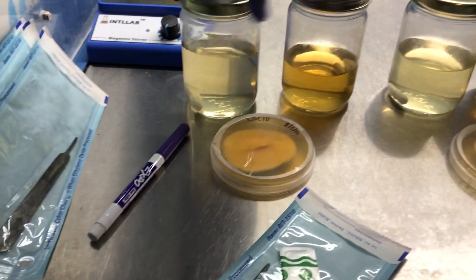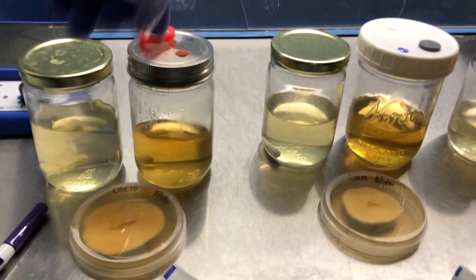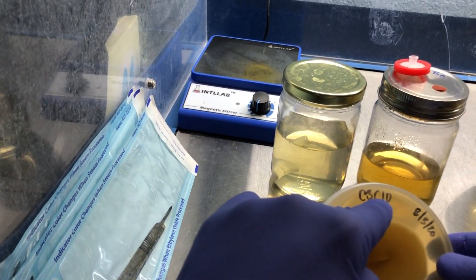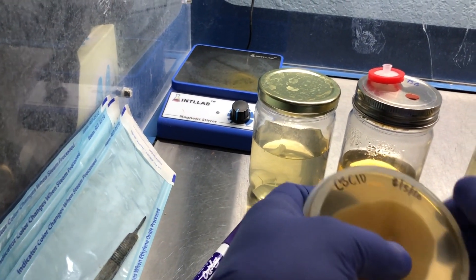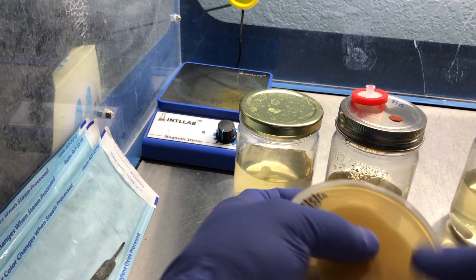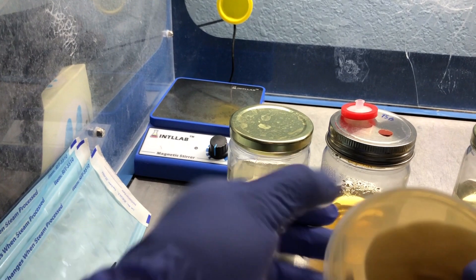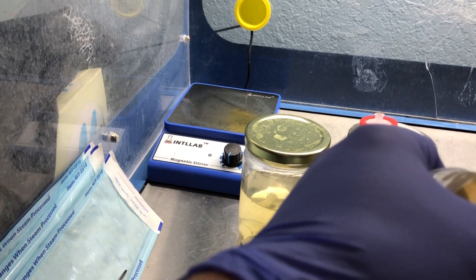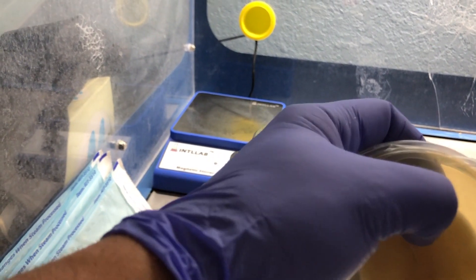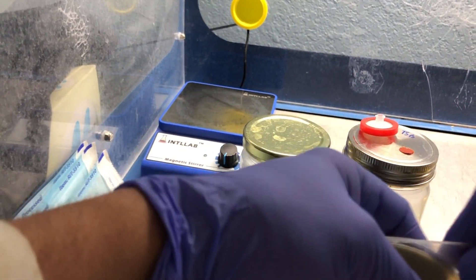I've got my honey culture for the honey solution on the left and the TSB on the right. We've got C3 and C10 from 18 days ago, and it looks like a really healthy screen.